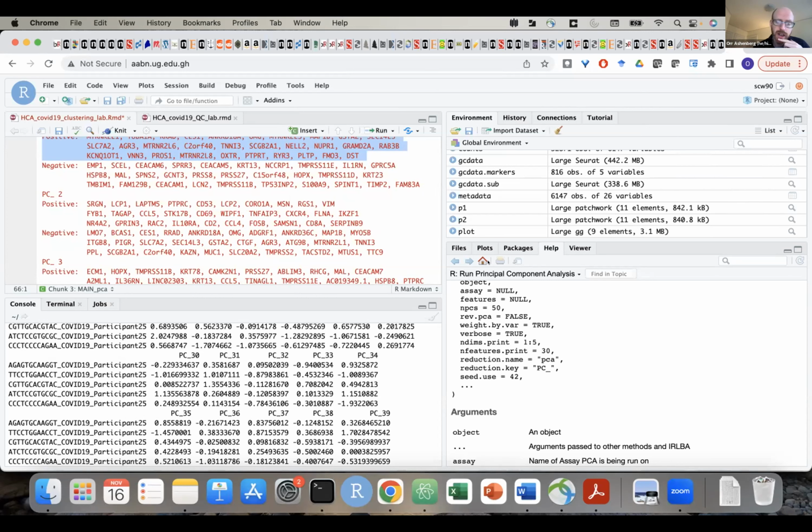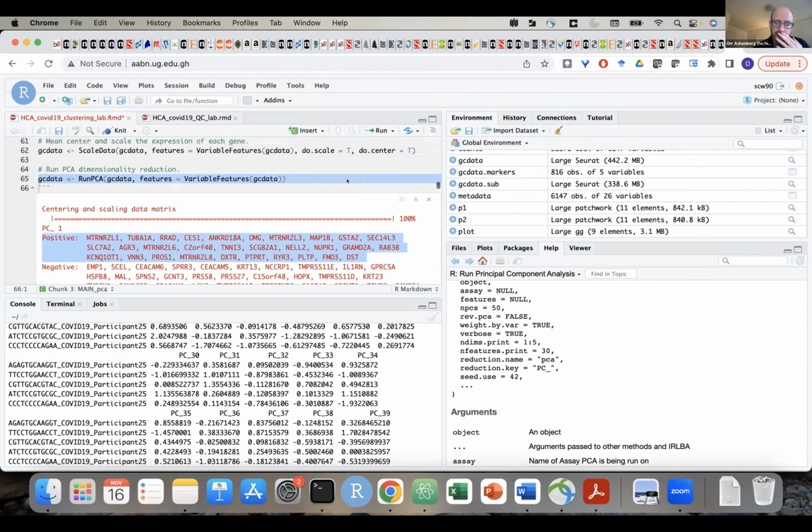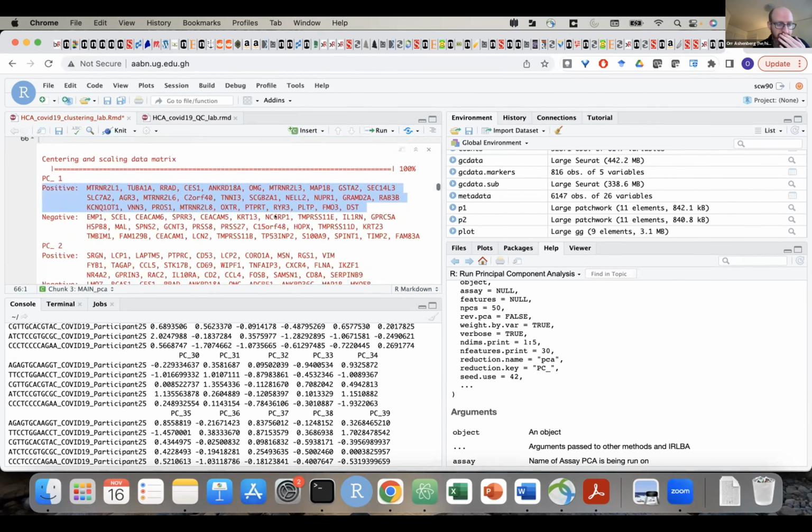So Isabel, any other questions about the PCA, or does that make sense, what's going on? No, it did. Thanks. It makes sense. Okay, thank you. Great, good question. Yeah, this is just, again, it's just like what Seurat kind of throws out there.